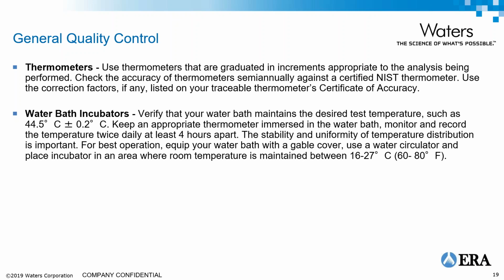You want to make sure that the incubator isn't sitting anywhere where it could be affected by diffusers for your air conditioner or your heater. If the temperature starts jumping around, it can cause you a problem with your analysis.